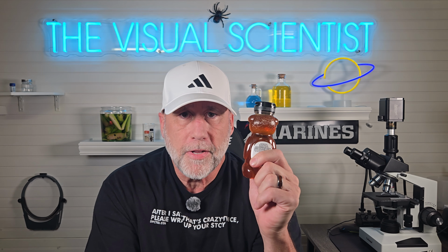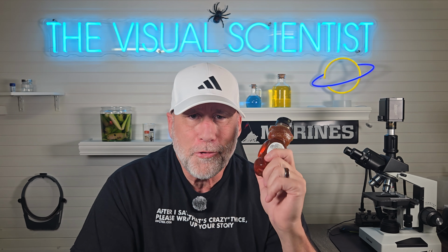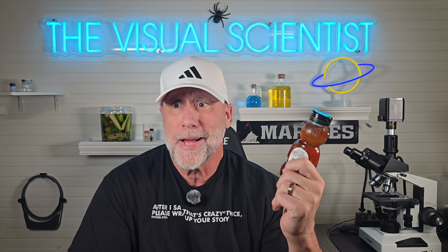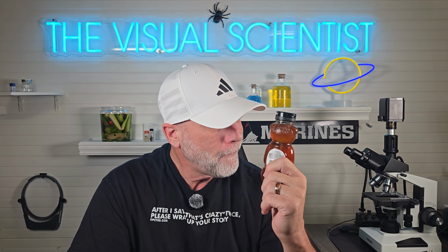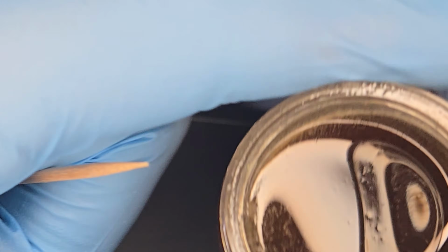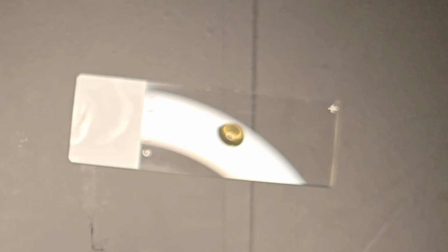Now this one, evidence B. Look at this thing. Isn't it cute? Little bear. You know this bottle. You've seen it on every diner and breakfast table in America, even outside of America. The little bear. I'm not saying anything else about it yet, but I want you to keep this one in mind. I can't do anything with my right hand. I'm left-handed, so bear with me. No pun intended. 3 slides ready.